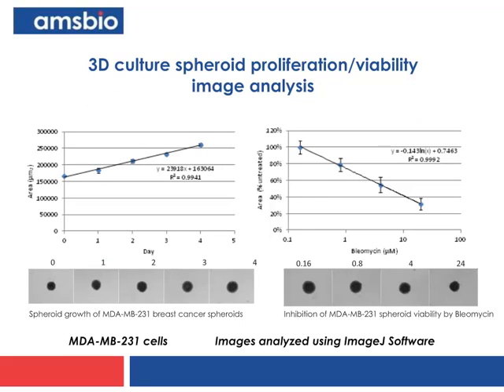So here is a simple example of that using MDA MB231s. These cells, without the spheroid forming matrix, would not form a proper spheroid, so they are really good for demonstrating how this matrix generates spheroids in the well. And what you can see, if you follow this day by day, is that the spheroids grow in area. You can quantify it again either by ImageJ or similar software, or by a direct proliferation assay such as MTT. And if you add your favorite drug, just on the right-hand side, you can really quantify the effects on the size of the spheroid very simply.